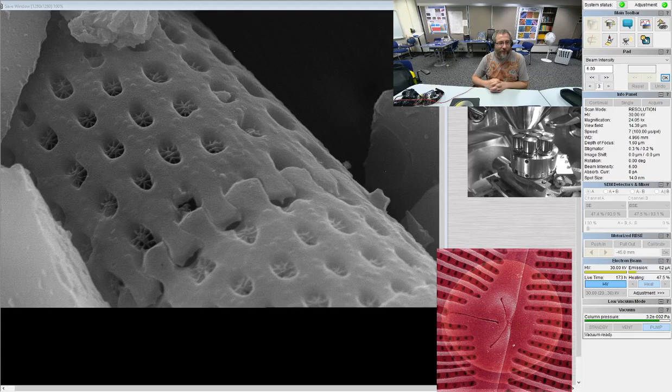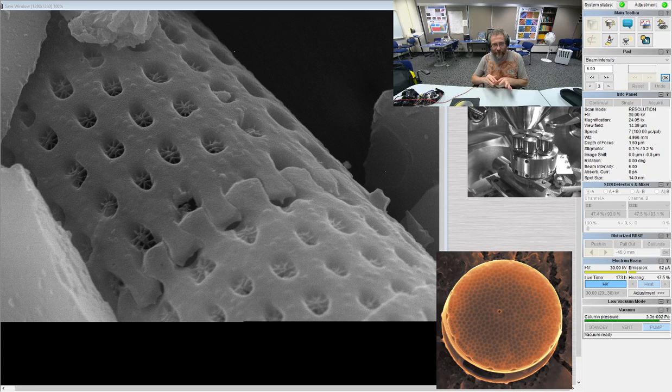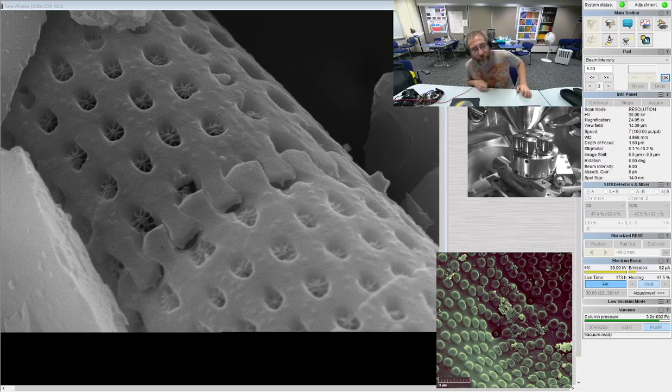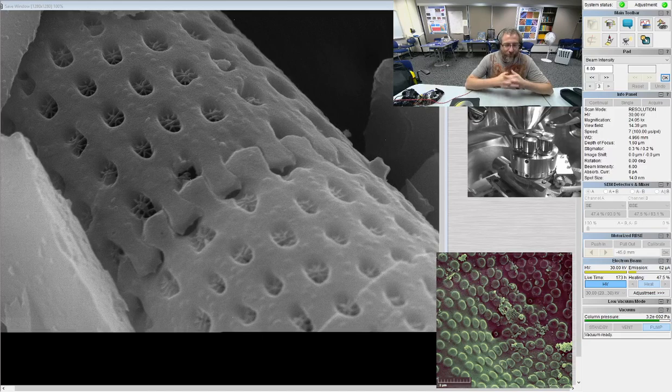But I did bring some. I brought one in that was living, but its wings were kind of wrinkly and it was soaked. And I put it on the stereoscope, and I got some really nice views. And I did a little stream this morning from the stereoscope with some living and some dead ones, and also some of the molting casings.